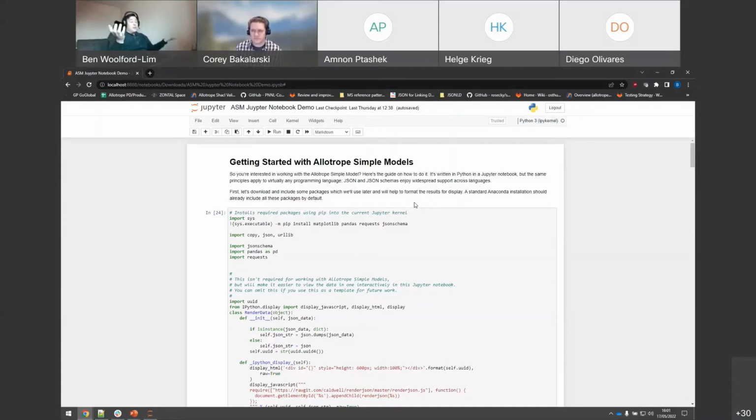And for context, I'm not a Python developer. As I said before, Corey had to do a lot of cleanup and making things look pretty. But putting this together took half a day, and most of that was understanding how Python works. It's really, really easy to work with. JSON is a very common format, and every language has libraries, and it's pretty easily structured to find what you want. So yeah, there's a question in the chat window.